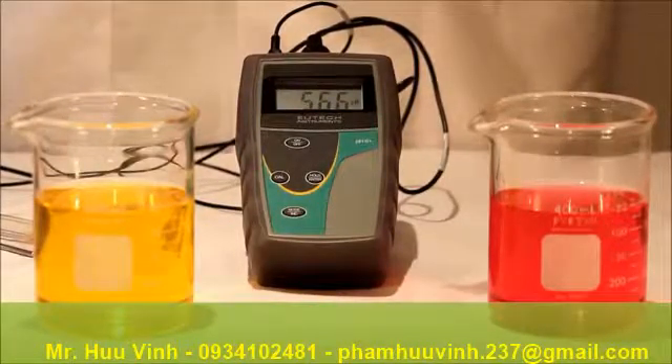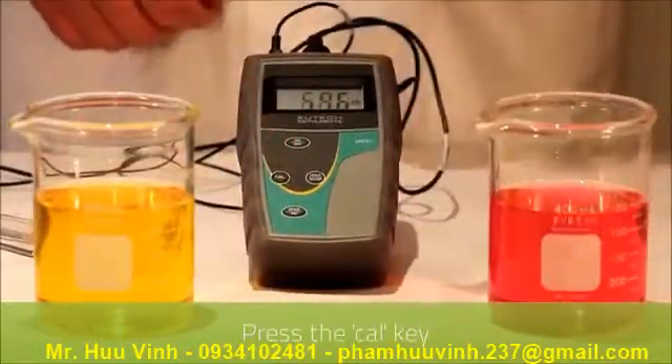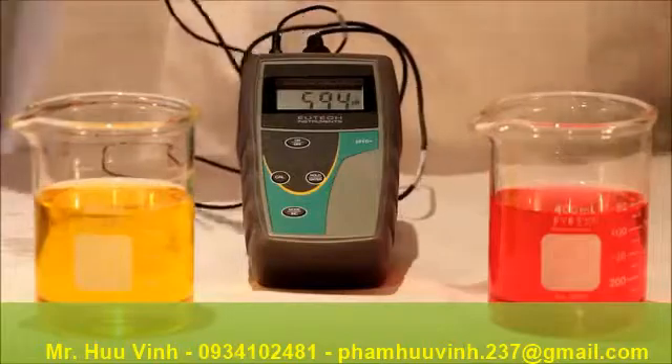Today we are using 7 and 4 PH buffers. First of all we press the CAL key to enter calibration mode and you will notice that the reading is flashing. This indicates that you are in calibration mode.